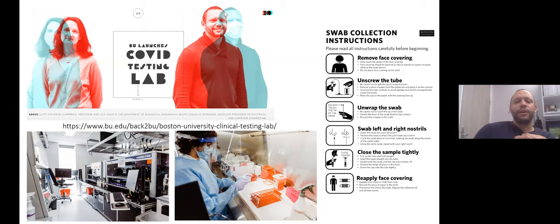And we decided that we were going to have students come back in the fall of 2020. But the only way that was possible was for us to test roughly 5,000 staff, students, and faculty a day. So we needed to test 5,000 people a day. And they thought, well, where can we do this? What lab is interested in robots and whatever? And I said, well, that's what my lab does. Just let us know and we'll get the one robot here and we'll go.